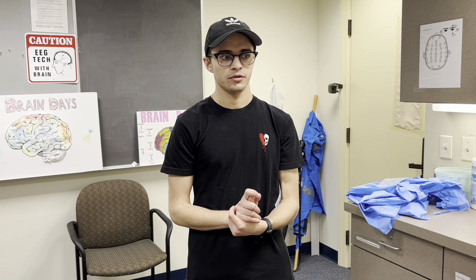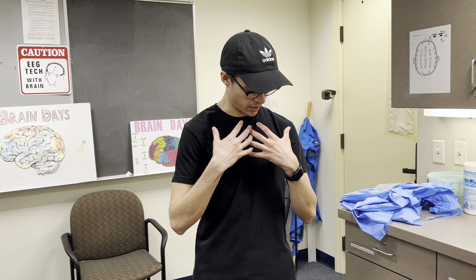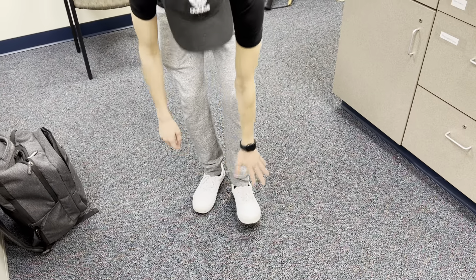Today we are going to be discussing the clothing that you should wear, as well as the clothing you shouldn't wear during the lab session, and the gear that is available for your protection in the lab. I suppose I can start with myself. I am wearing a short sleeve shirt, sweatpants, and closed-toed shoes with kind of a fake leather.